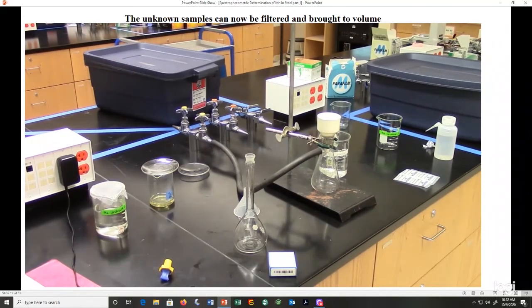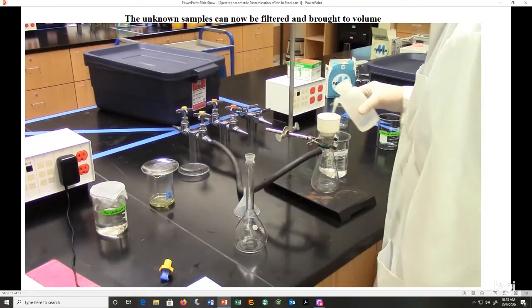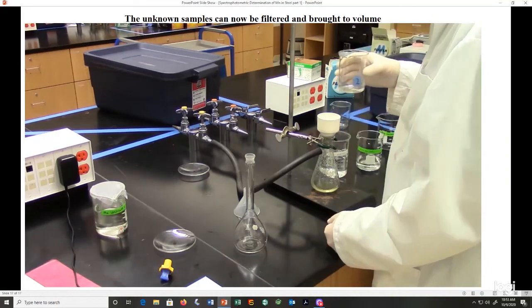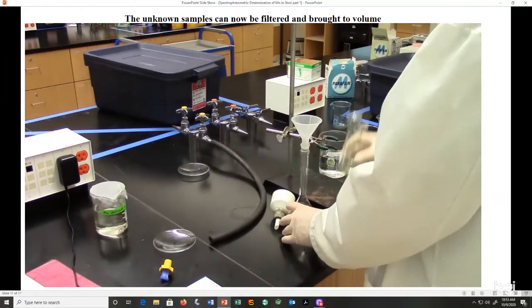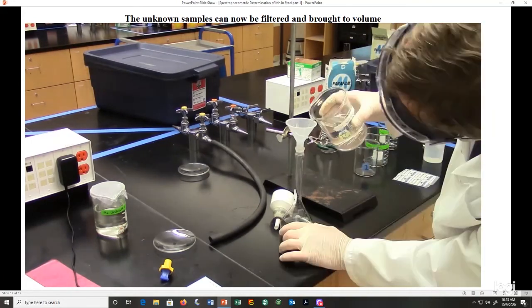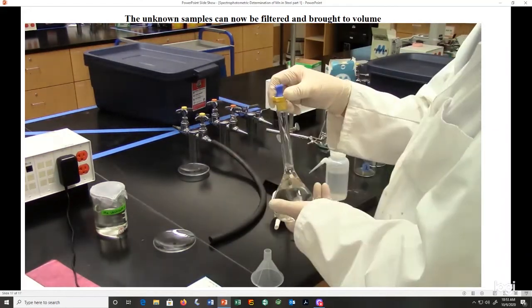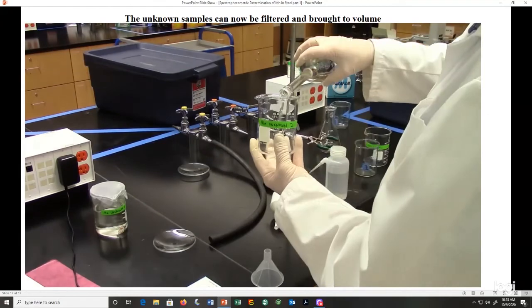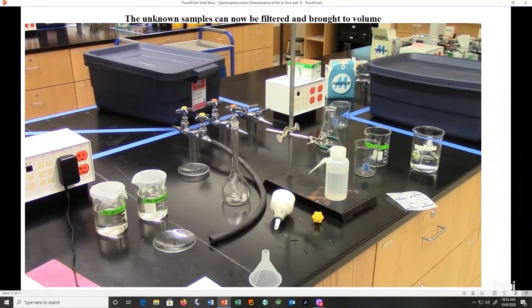So now we can move on to unknown 2. And we'll speed this up a little bit. We've seen this once before. So now we've prepared both our unknowns and our standard, so we can move on to lab video part 2.